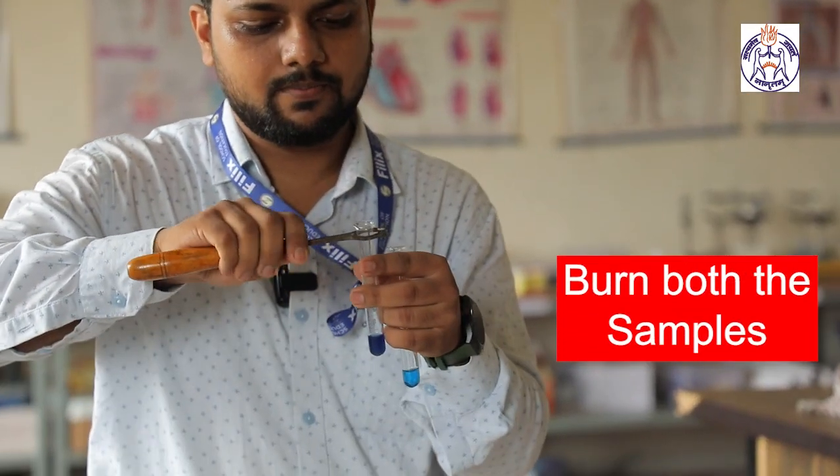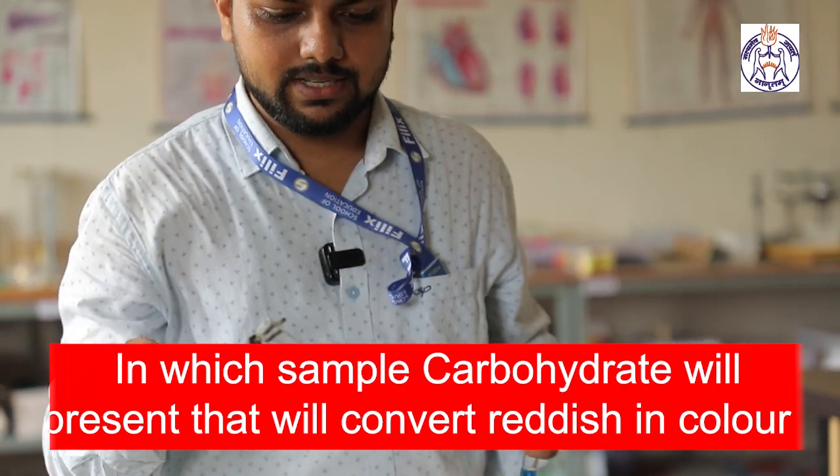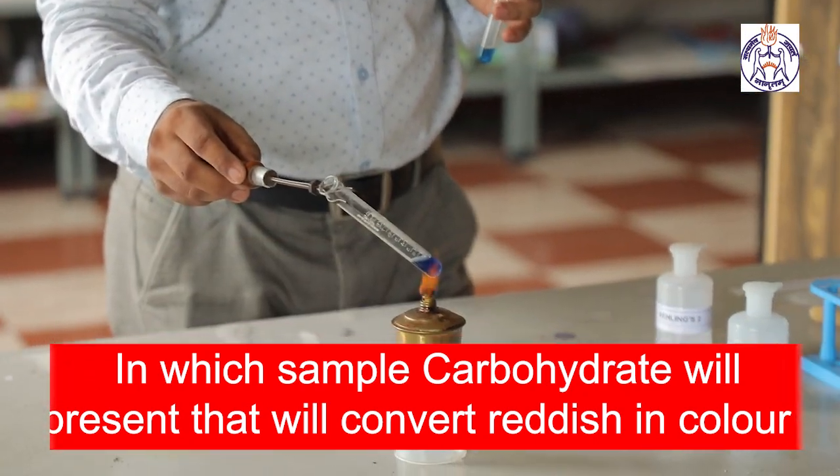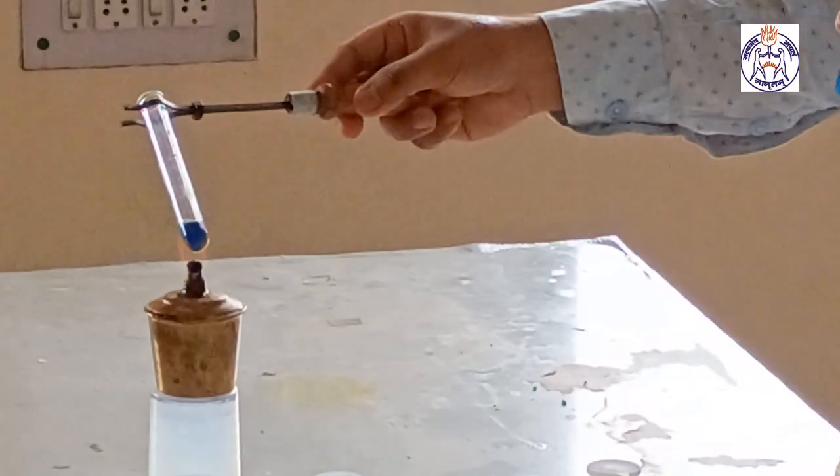But when we burn both the samples, you will see that the sample in which carbohydrate is present will convert into reddish in color. So let us observe.